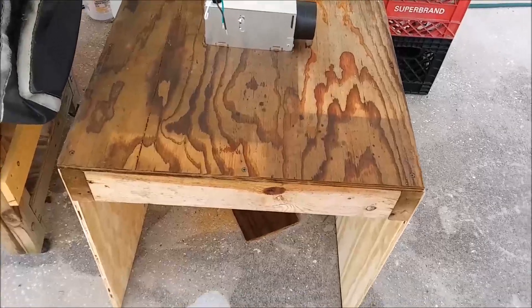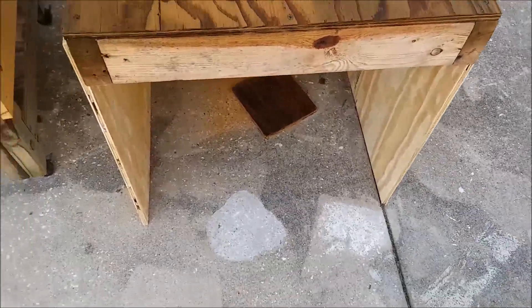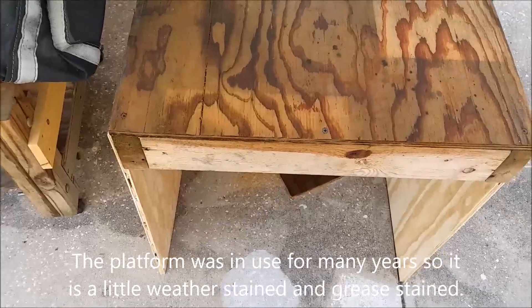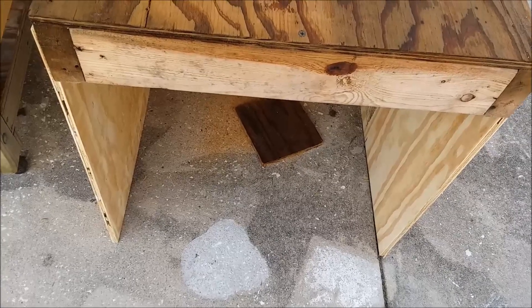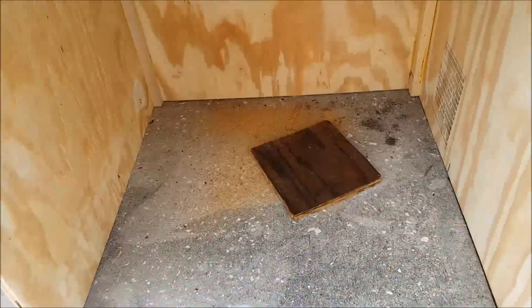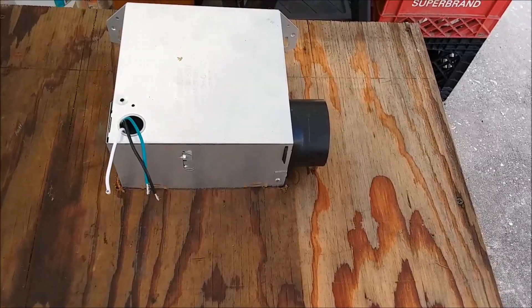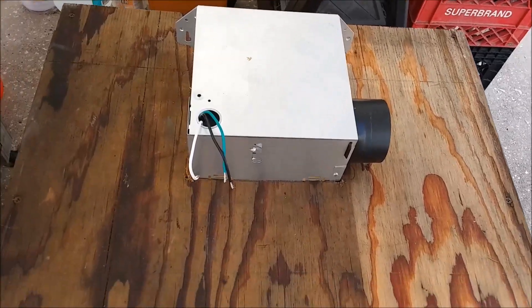Here's my fume hood under construction. It's basically just a three-sided box with a lid on it. The top is a platform I had for something else and I just screwed some sides on it — three sides. On the front there will be Lexan doors eventually. I've got a bathroom exhaust fan and I just cut the hole out to mount it, and I'll run a piece of flexible tubing off to a goodly distance from where I'm working.